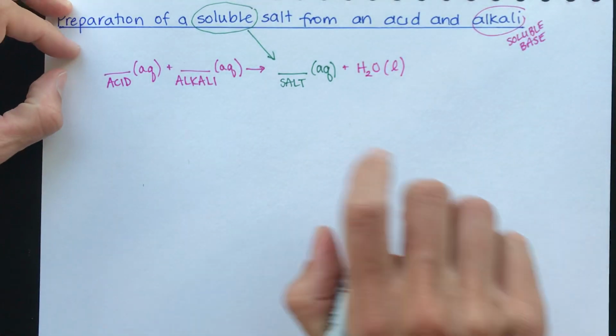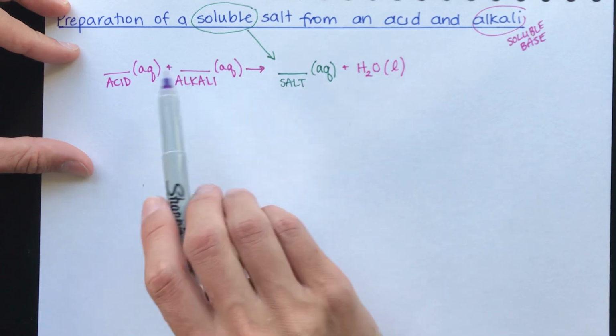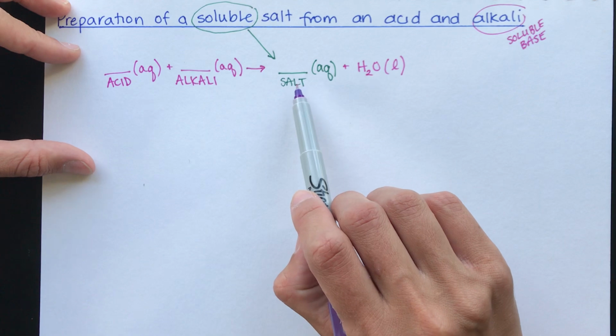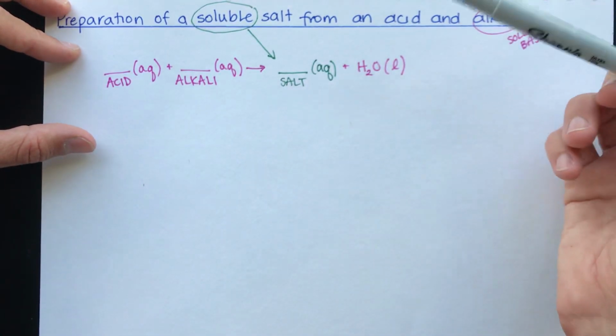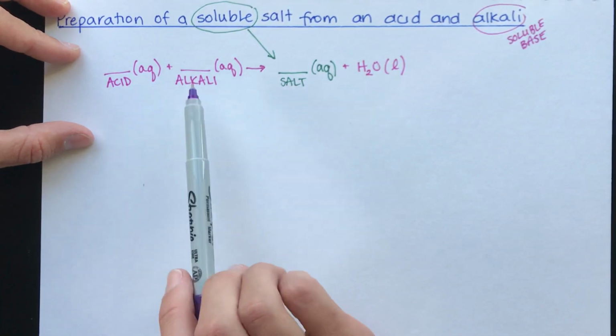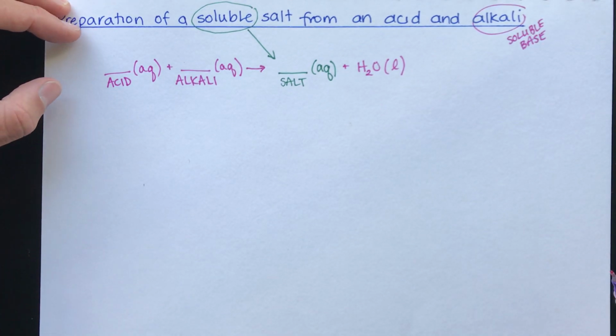So what you should notice here for the first time is we don't have a solid. And because there's no excess solid reactant and there's no solid product, you're not going to be able to use filtering. There's no way to separate the soluble salt from either of the soluble reactants. So our only choice here is going to involve some new equipment that you haven't seen before. All right, so let's get to our example.